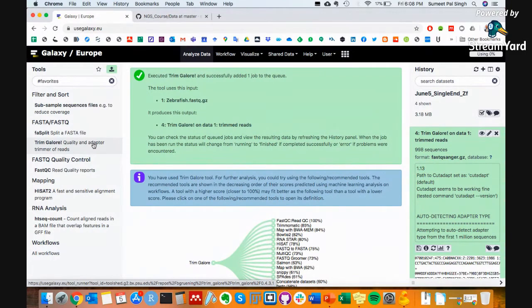sometimes you just do a preliminary experiment and you want to know what is happening, right? If you don't have replicates, then it's almost impossible to do statistics, because n equals 1, you cannot really do statistics. But you can split it, call them technical replicates, and then do your analysis, right? So how do you split it?